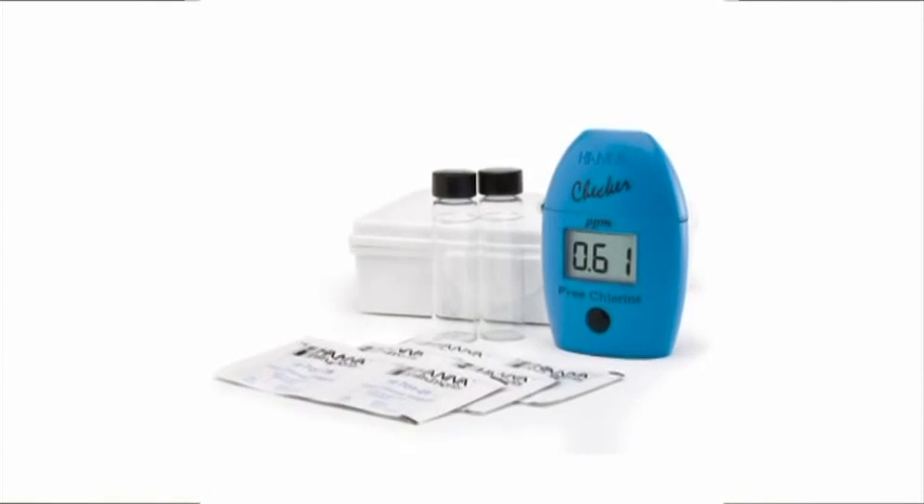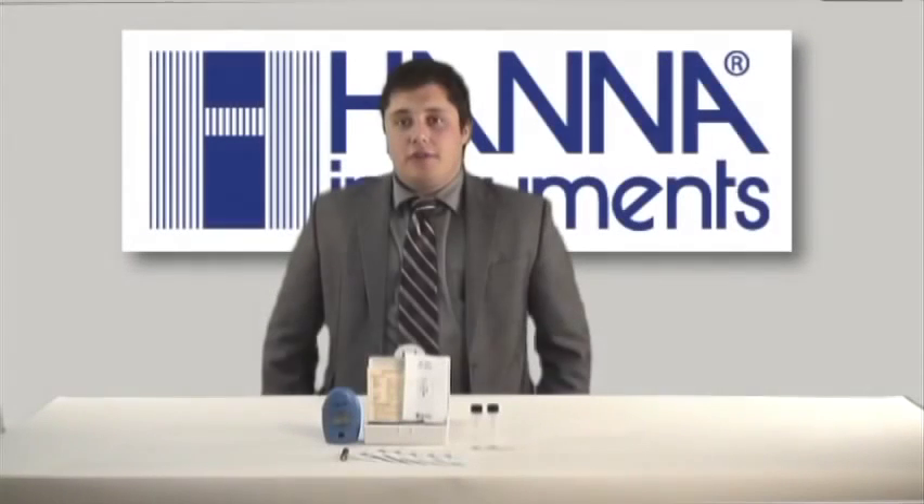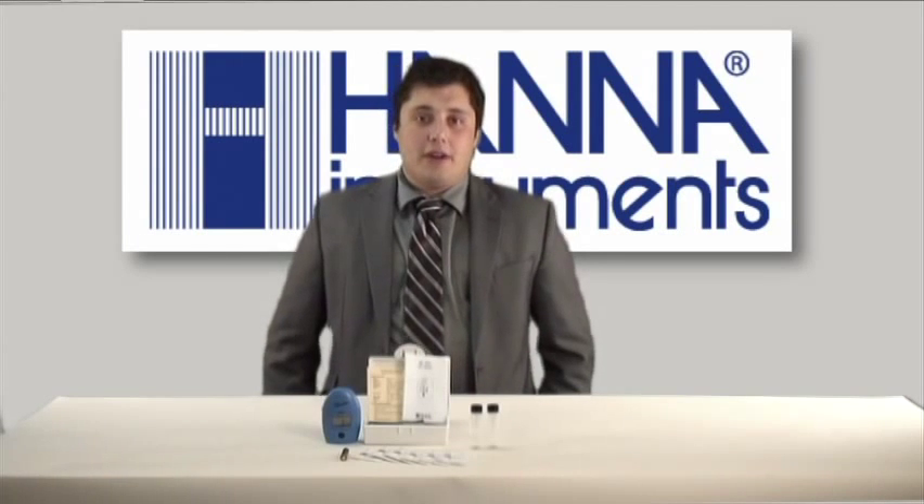Hi, my name is Steven Burnett. I'm an applications engineer for HANNA Instruments. Today we're going to be going over the HI701 Handheld Colorimeter. The 701 is our free chlorine handheld colorimeter and it's part of our checker series, which are designed to be low-cost, high-reliability instruments.